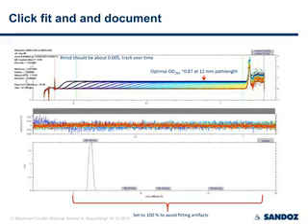And to avoid fitting artifacts, because when you're an experienced Sedfit user, you may notice at 0 or at the lower fitting limit and also at the upper fitting limit, you may have these peaks which shift always when you increase or decrease the fitting range. So for example, you have this artificial open peak, half peak at the end of 20S. When you increase the fitting range to 30S, it's still there. You increase to 50S and it's still there.